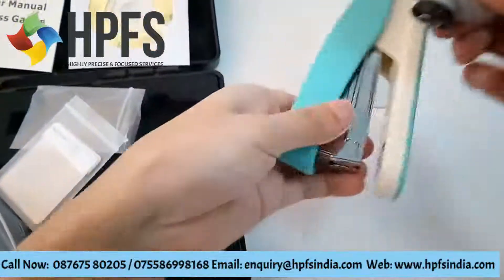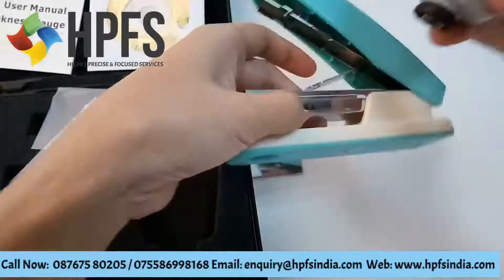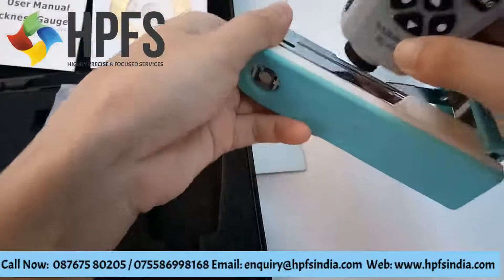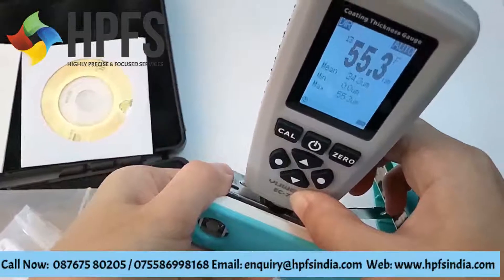We check this sample. It's magnetic steel — measuring the coating.